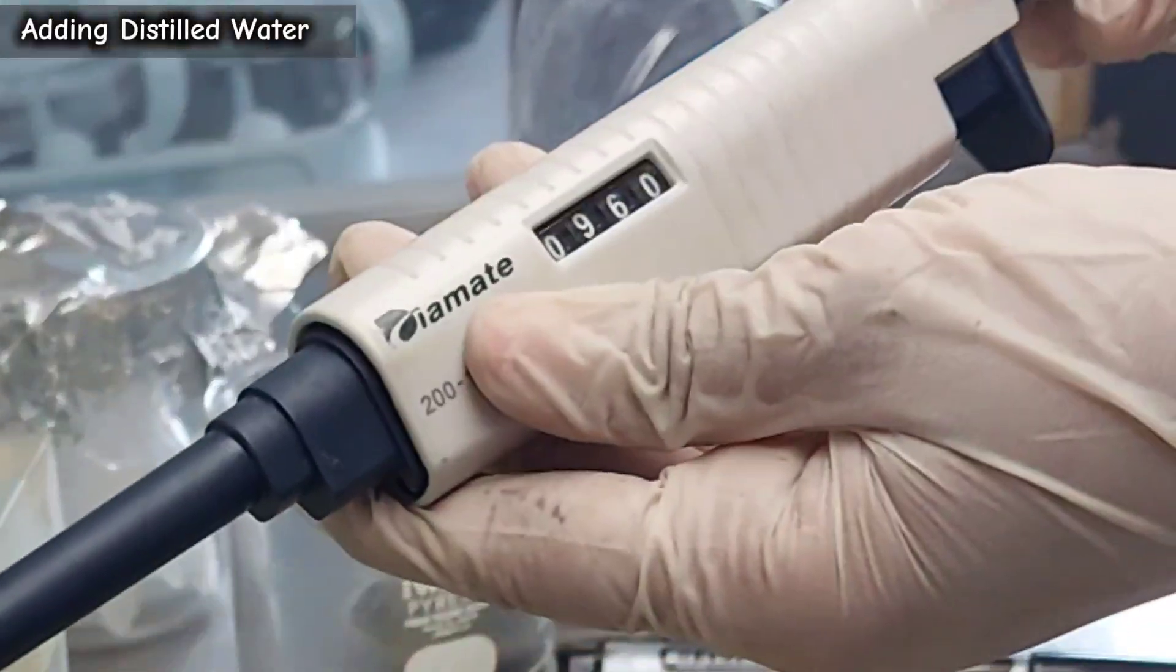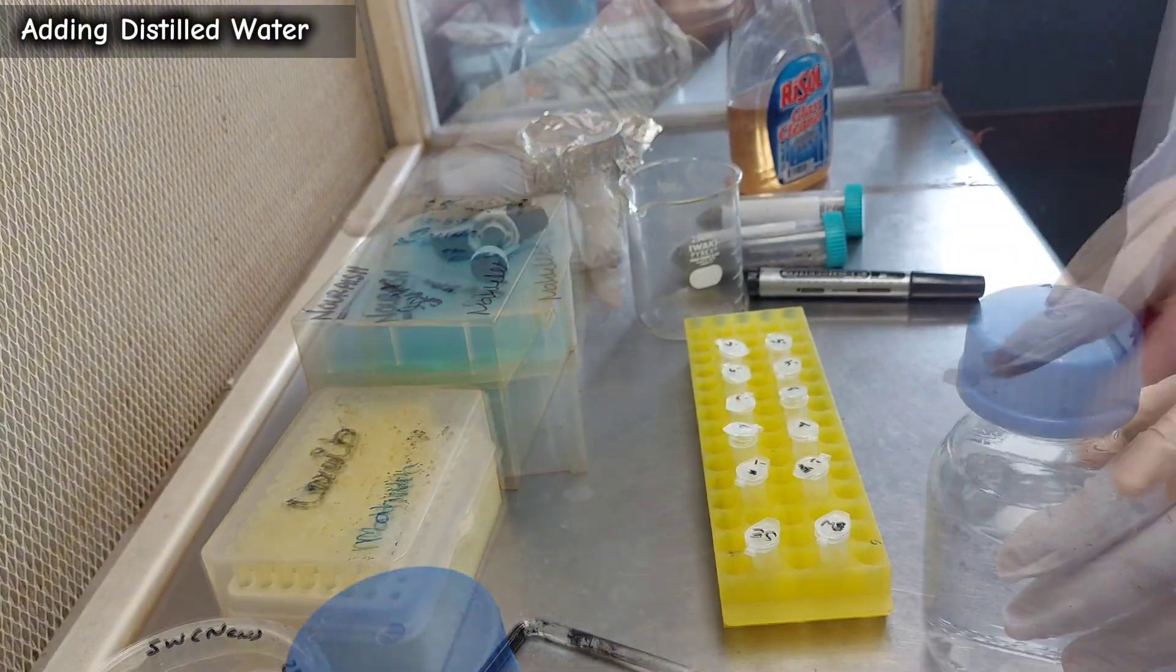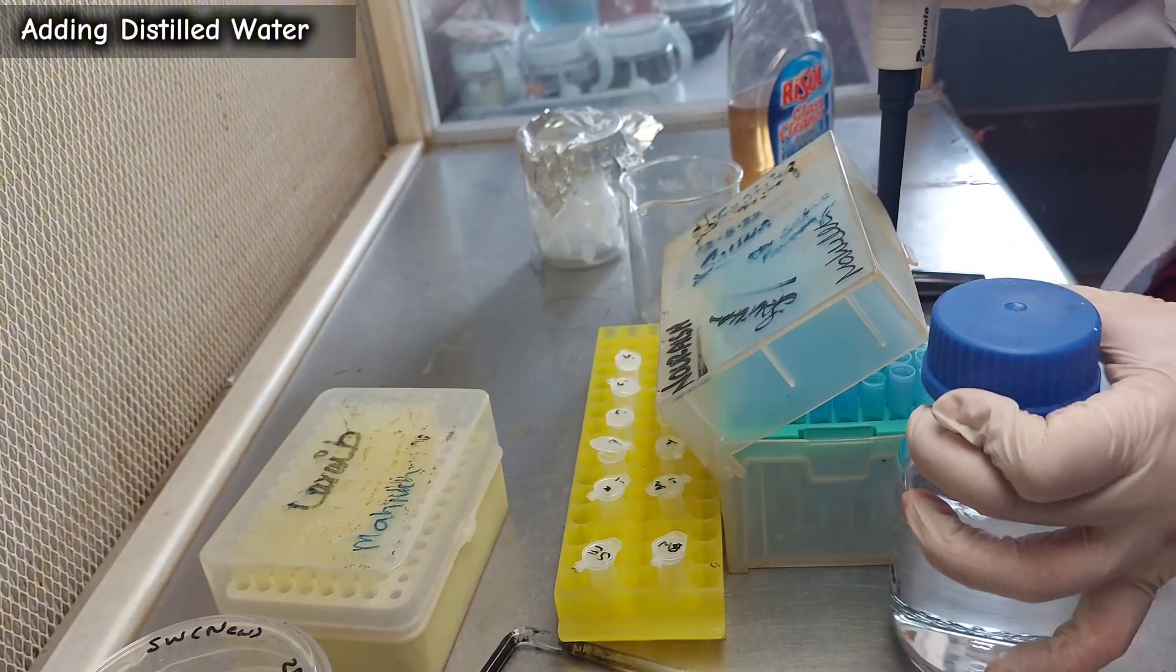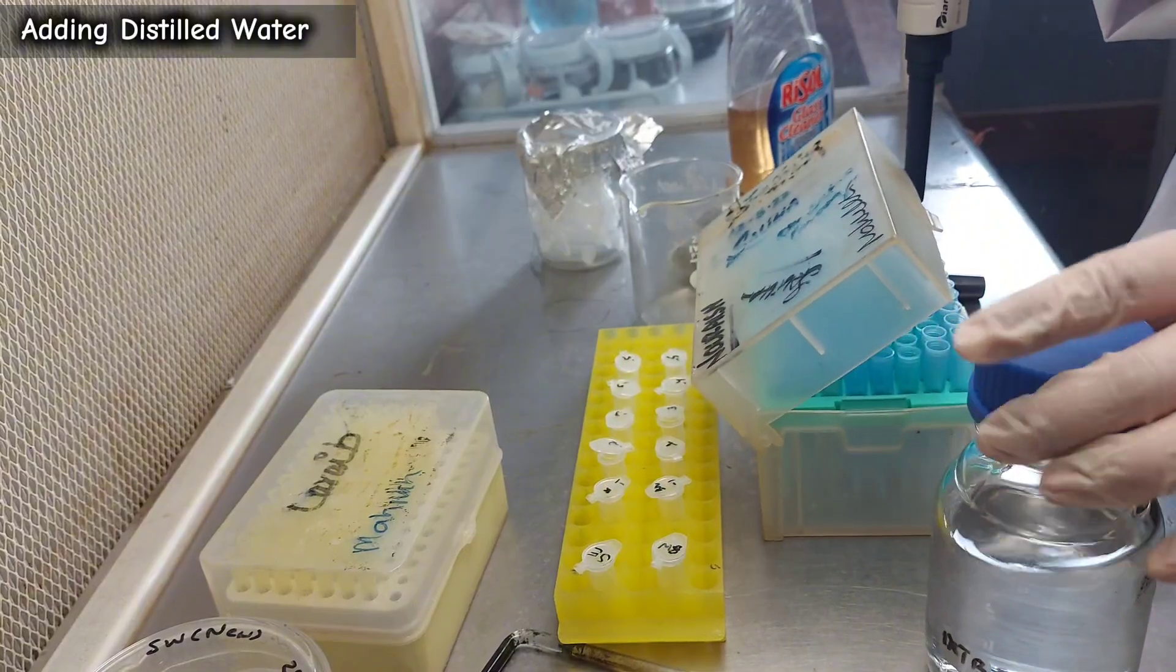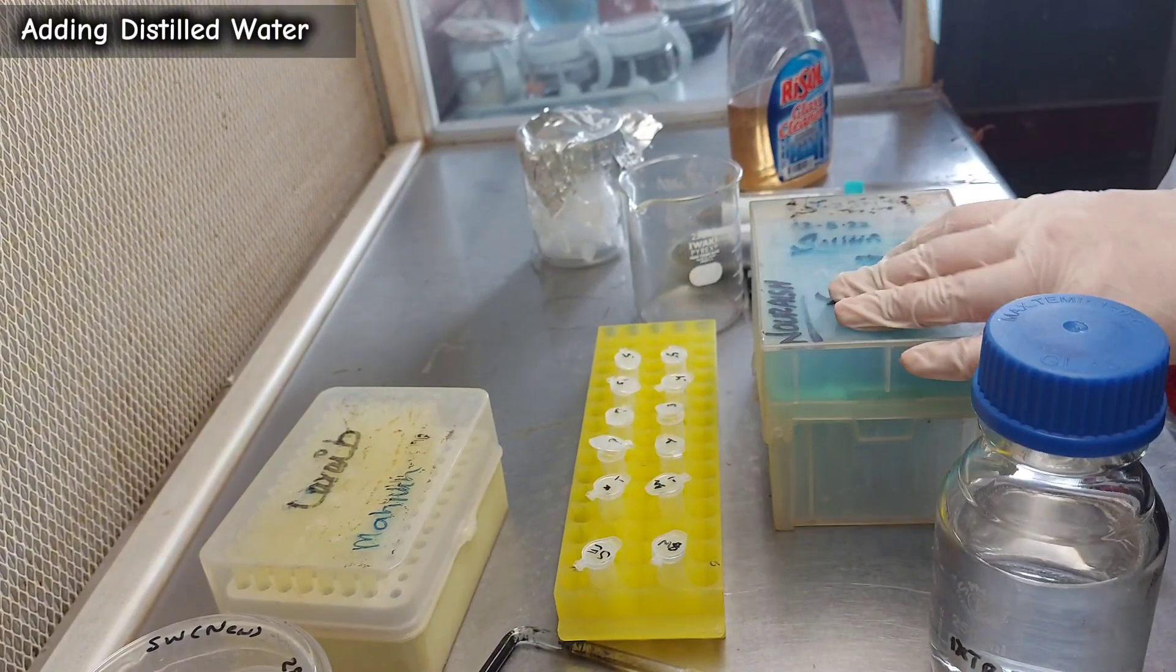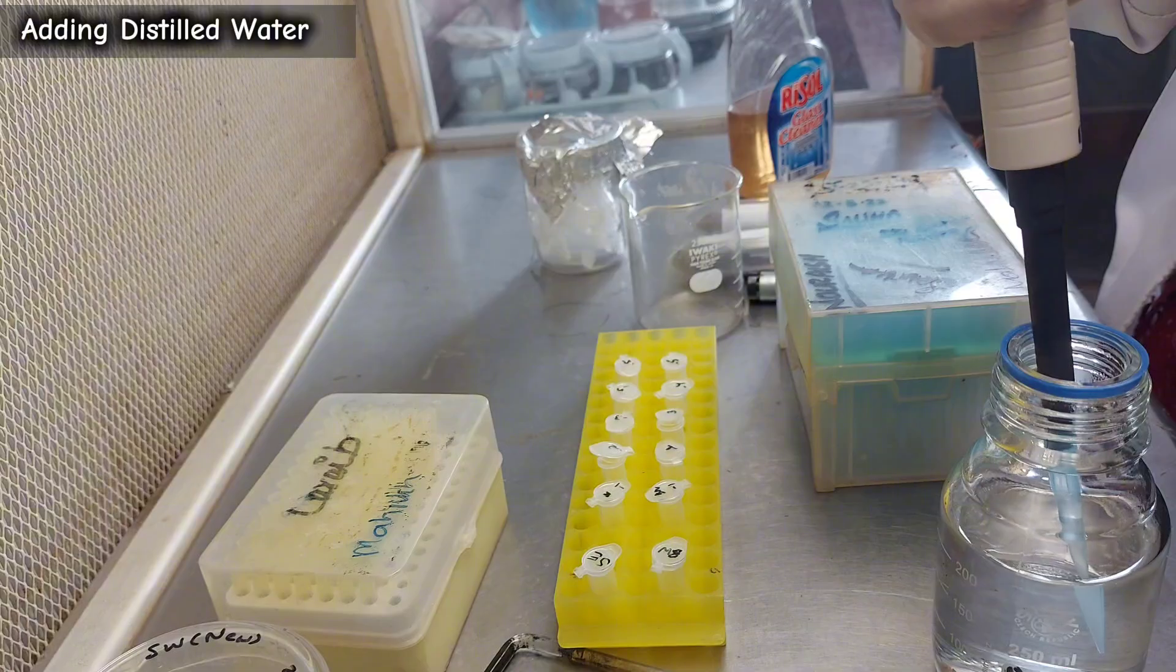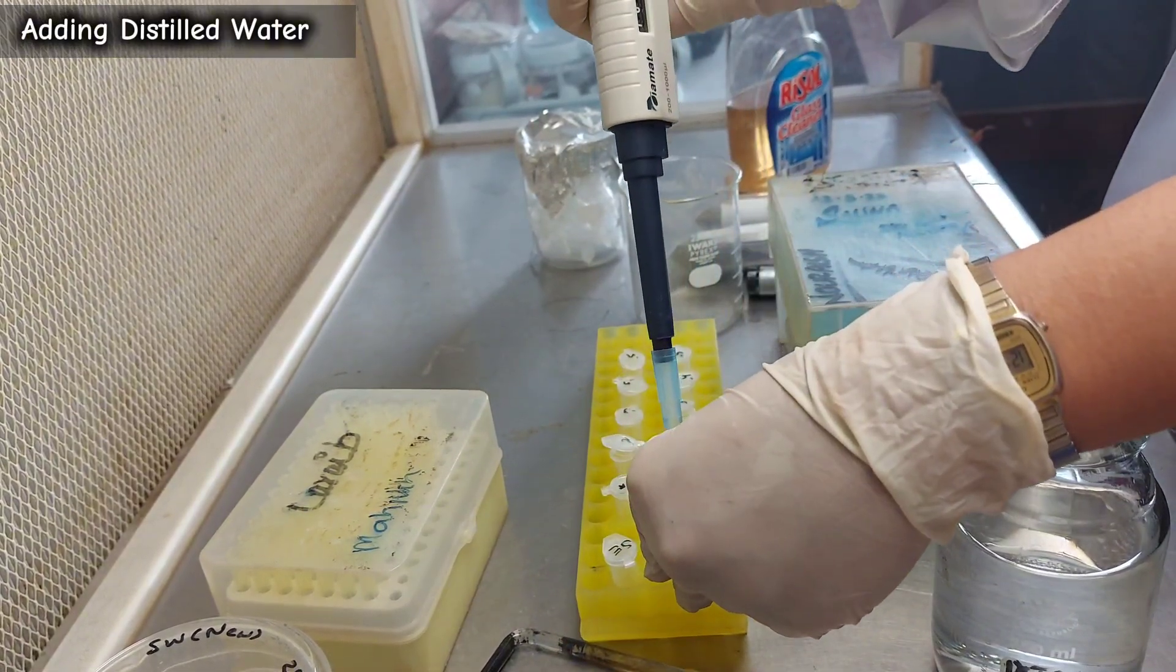Set your micropipette to 1000 microliters and use a blue tip to add distilled water. Fill the stock Eppendorf tubes first.